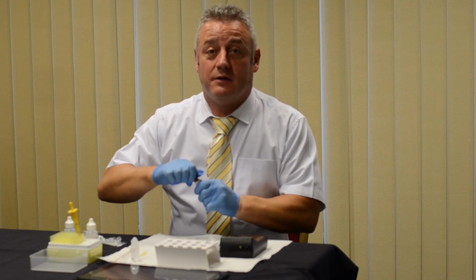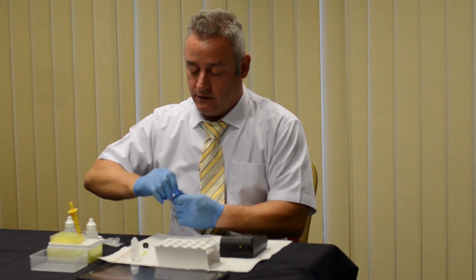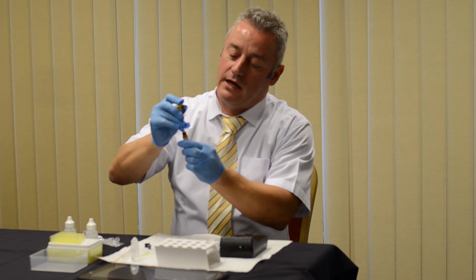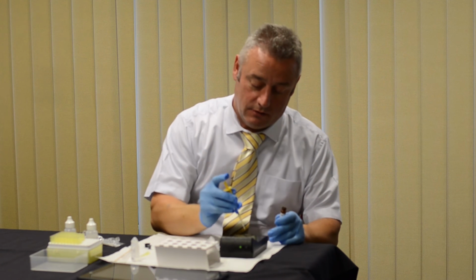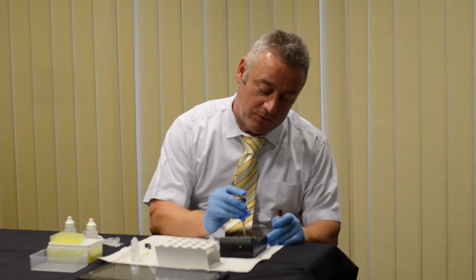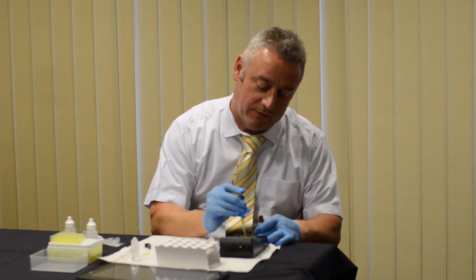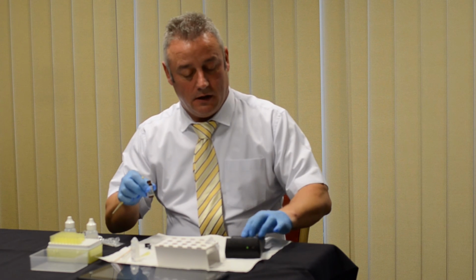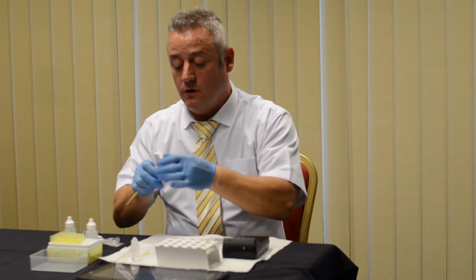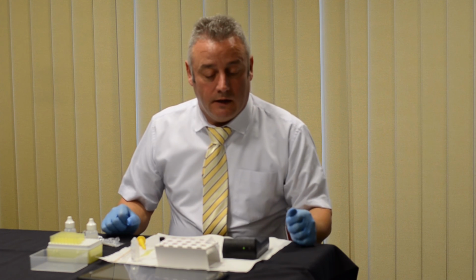Now what I need to do is make that bacteria luminesce so that the monitor can pick it up. So I use this LL solution. I'm going to get 50 microlitres of the LL solution into the micropipette and put it into the drawer. Now there's a solution in there of 100 microlitres. And I'm just going to mix it a little bit to make sure it's all mixed in, and then close the drawer. What's happening now is, in the same way as it did before, the LED lights are flashing across the front of the screen. And then, there we go.